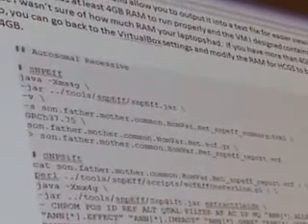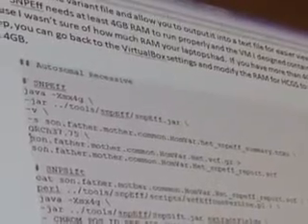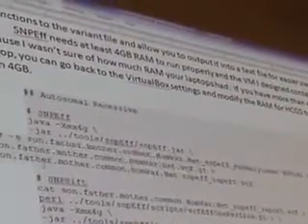And so what you get here, and let me also explain one thing, is that I have all these lines of commands and parameters broken down line by line. And really, at the end of the day, this command, you could copy and paste it, but it really looks just like this: one gigantic line of code. And so that is the entire command that you would type to have SnpEff run.